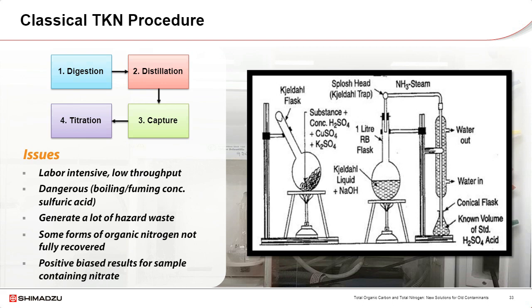So theoretically, at temperatures in the neighborhood of 370 to 380 degrees C, any organic nitrogen compounds are converted to ammonium ion. The converted ammonium ion, together with any ammonium that was present in the samples, is either distilled, diffused, or determined directly in the acid mixture, depending on the method being used.